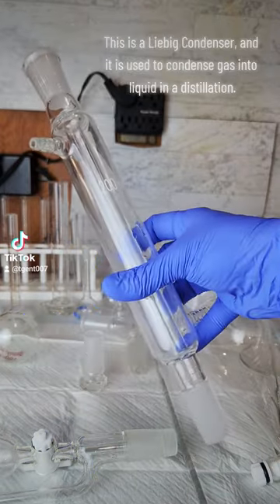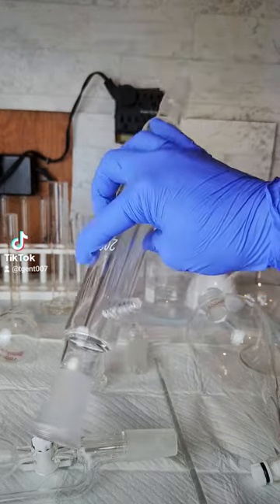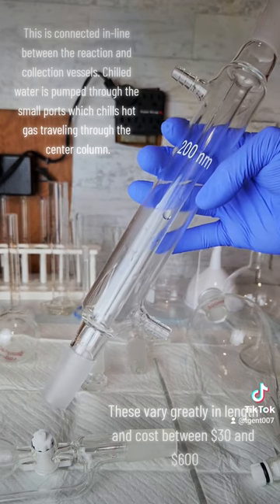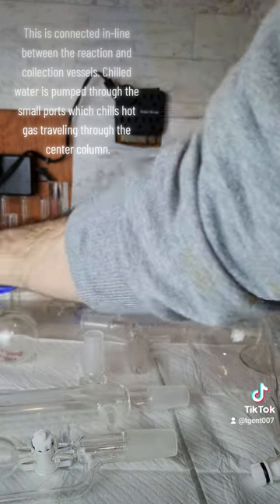This is a Liebig condenser and it is used to condense gas into liquid in a distillation. This is connected in line between the reaction and collection vessels. Chilled water is pumped through the small ports, which chills hot gas traveling through the center column.